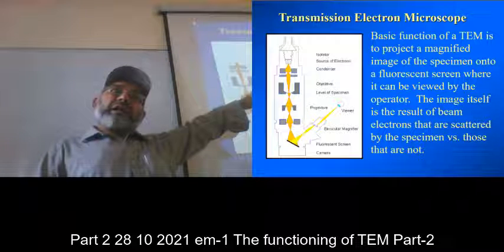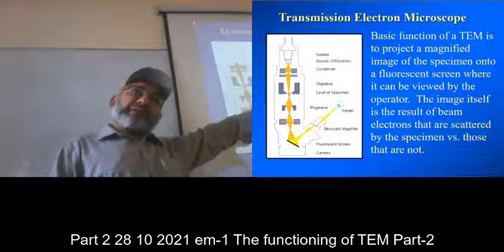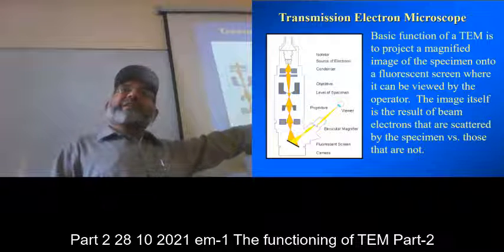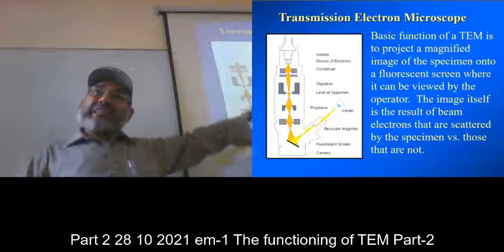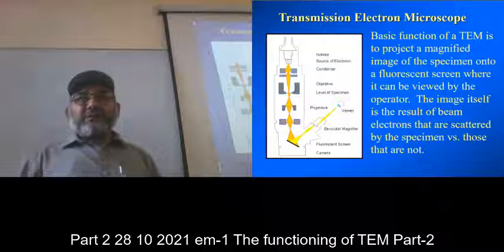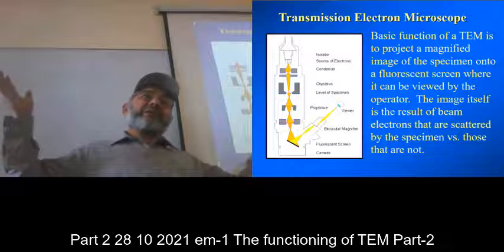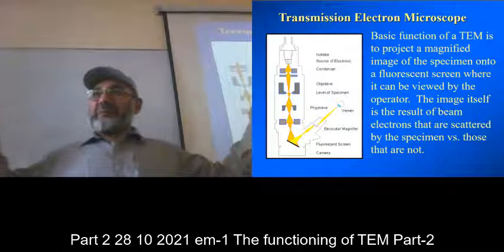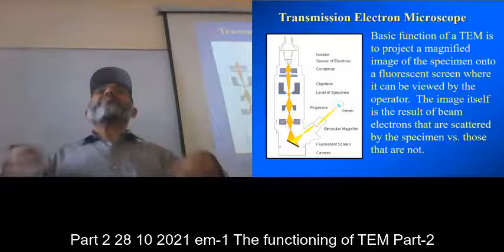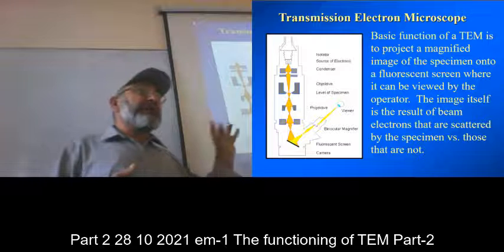those events, after the interaction with the specimen, the beam is again collected by the objective lens, and each lens then magnifies it as well. So on one way they are removing the large angle scattered beams, and in the second place they are magnifying that beam as well, because they are not losing the magnification.